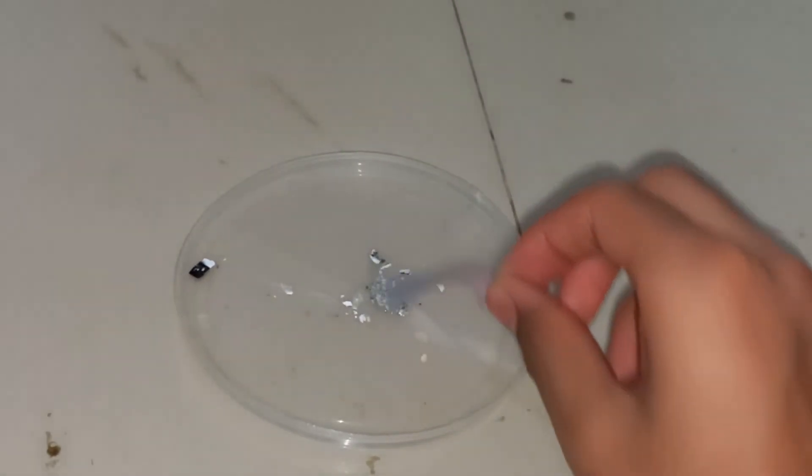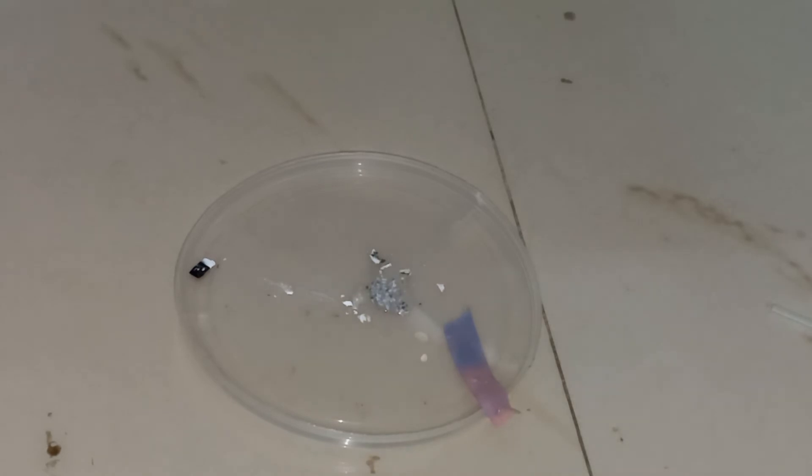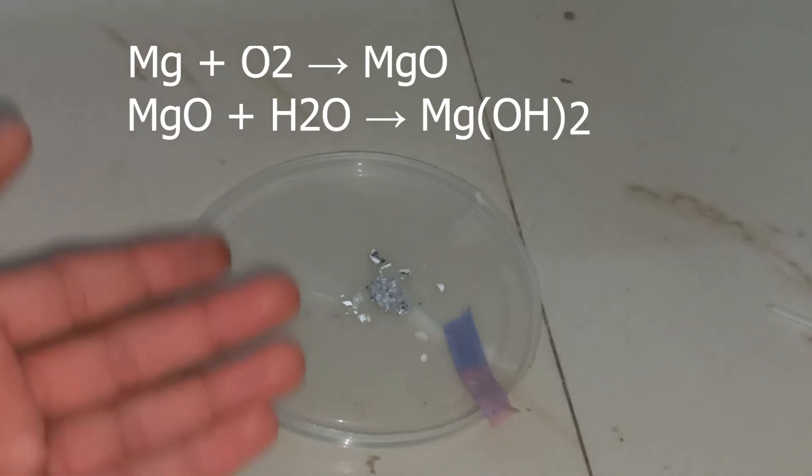So let me get it out. You can see the color is blue which means it is basic now. Magnesium hydroxide is basic. So let me tell you the equations. What happens is that when we take magnesium strip and when we burn it, it reacts with the oxygen to form magnesium oxide. And when we put it in water, it reacts with the water to form magnesium hydroxide.